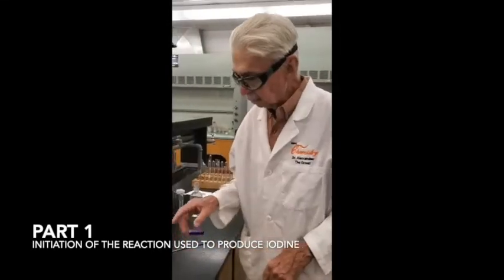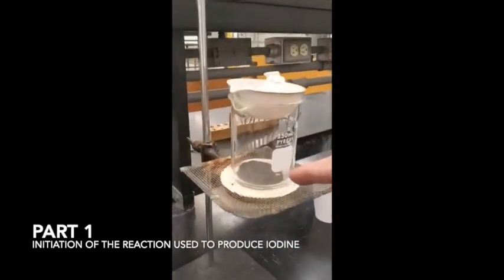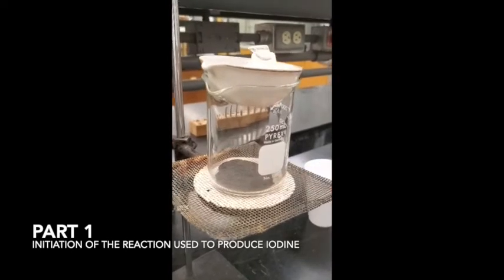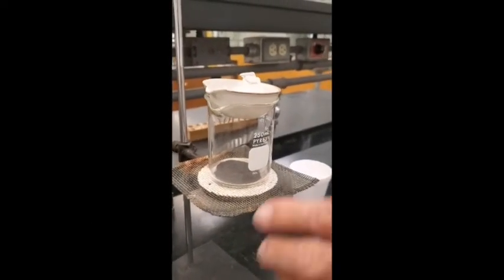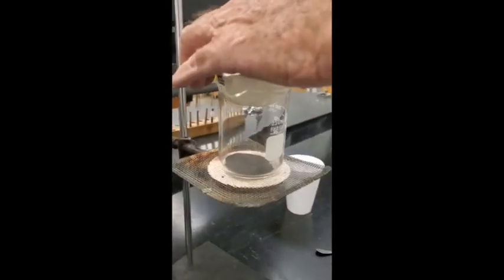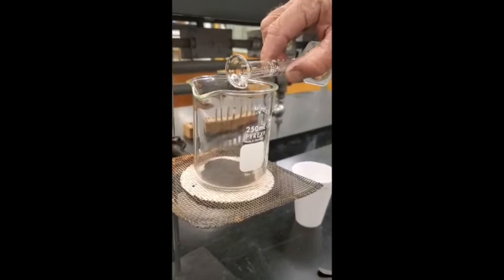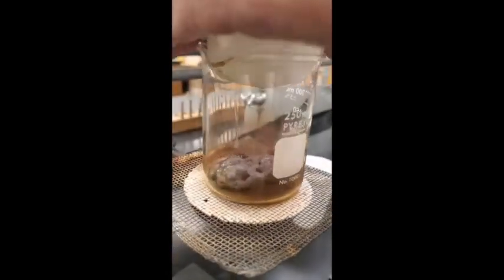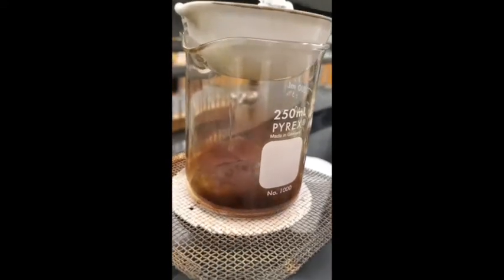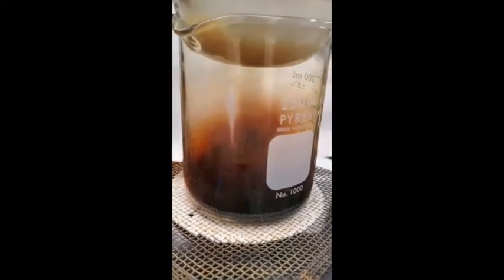Hello everybody. We've now mixed the manganese dioxide and the potassium iodide. And now what I'm going to do is add the sulfuric acid, and start heating it. And we should start getting a vapor being produced. See, it's already reacting. You see vapor in there, right?